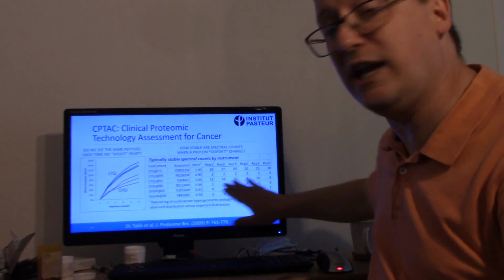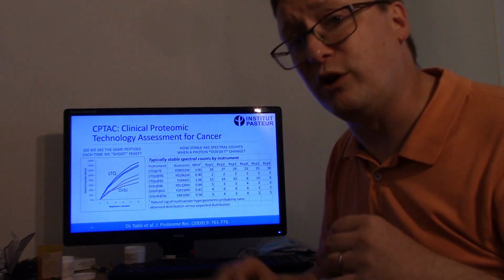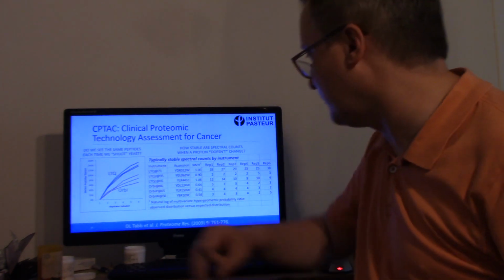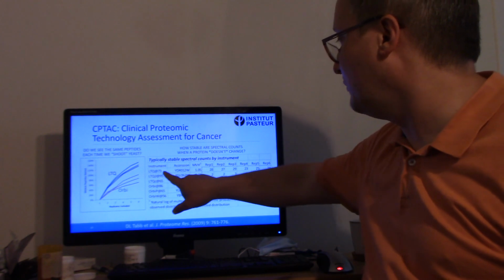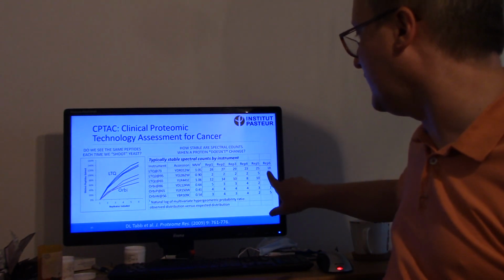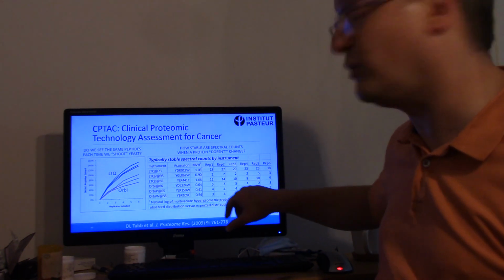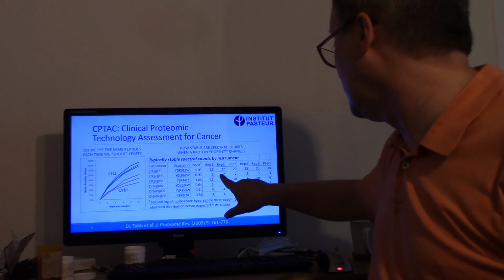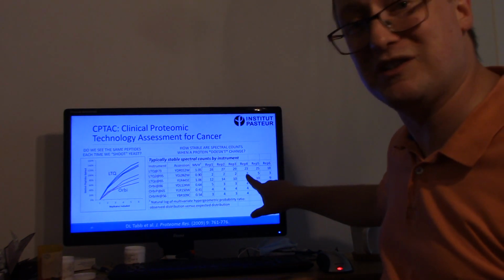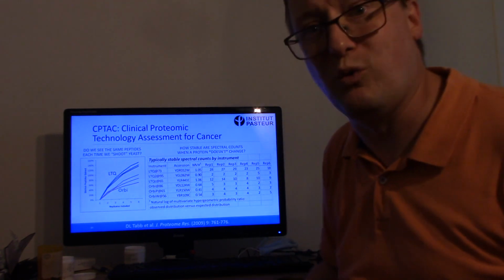Again, over here we're looking at just yeast, and we're asking from a statistical point of view, what is the typical amount of variation that we observed in these? And in this case, we see that for the 3 LTQs, these first 3 rows show a fair bit of variation. Again, for the top protein, a range from 18 spectra up to 29 seen for this protein. In the second case, we see that 4 of the 6 experiments identified exactly 2 spectra for this protein. The last 2 both produced more.